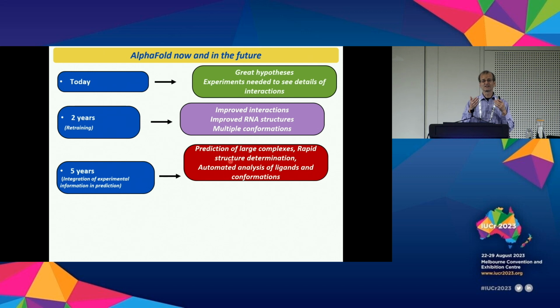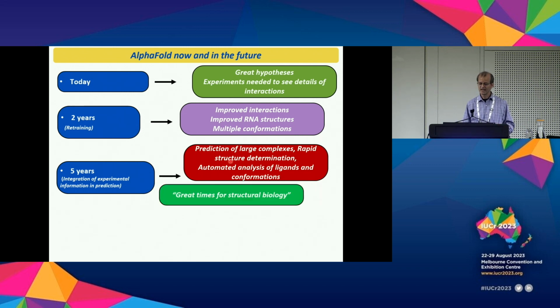It's going to do analysis of density maps, how to build the model, how to put it all together. It's going to do that as one step instead of doing it as separate steps. That's going to be a totally new thing. It's going to be really awesome. I think it's going to be incredible. That's going to help us with large complexes, rapid structure determination, and ligands and conformations are going to be coming into that story as well.